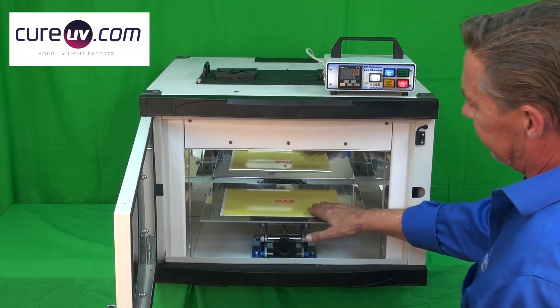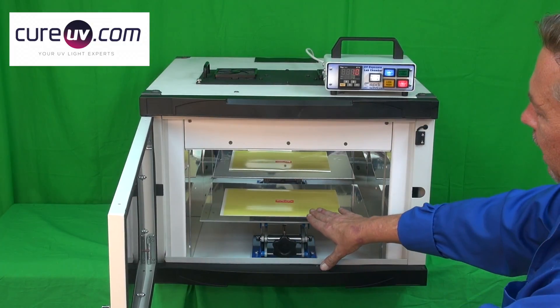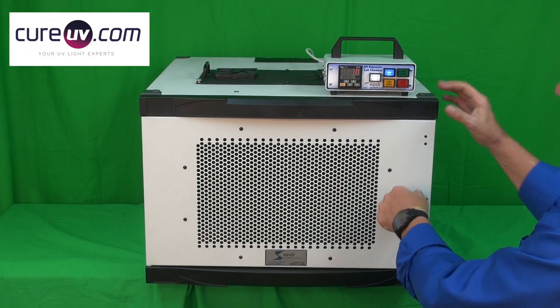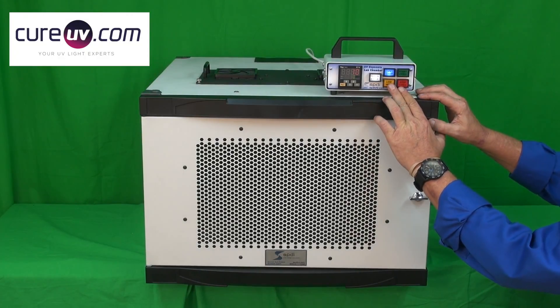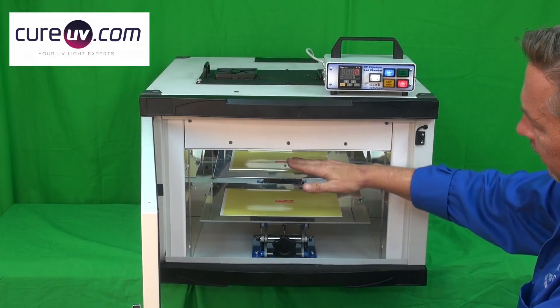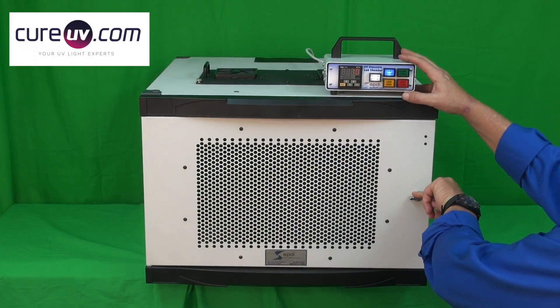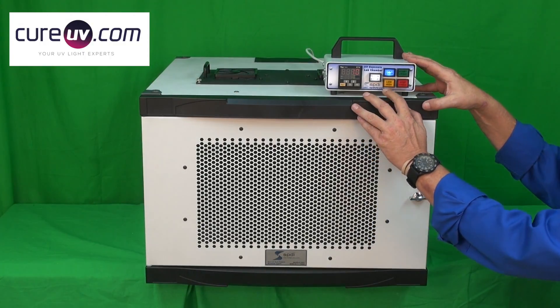This UV intensity sheet will change or darken in color based on the amount of energy supplied into it. With a rapid method of control both in intensity — high and low — or variable through distance of lamp to shelf, you can configure or reconfigure virtually any type of exposure parameters you need.